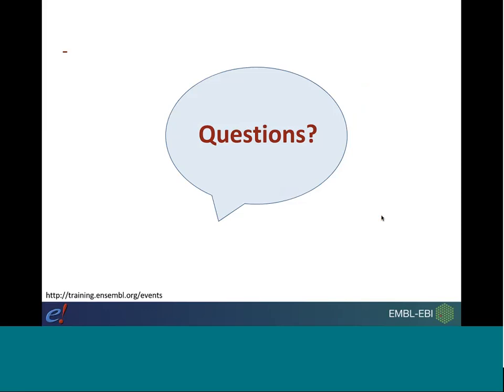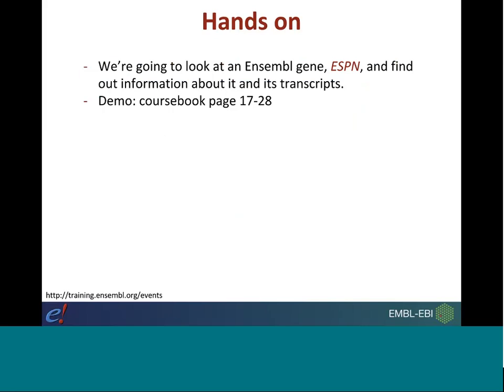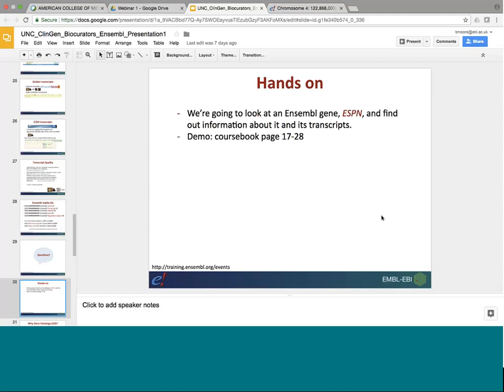Okay, so again, just want to quickly see if there are any questions that have arisen from my presentation in the last 10 or so minutes. No? Okay, so what I want to do now is move on to showing you the genes and transcripts that we have in Ensembl. So we're going to look at a particular gene called ESPN. So I'm going to search for this in Ensembl.